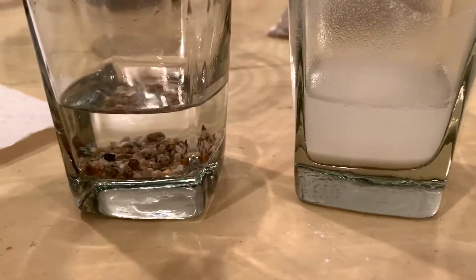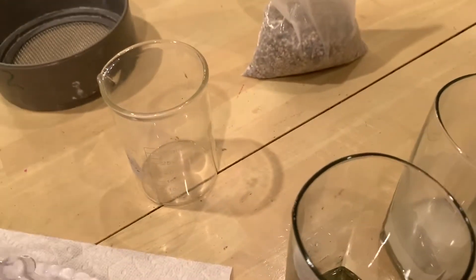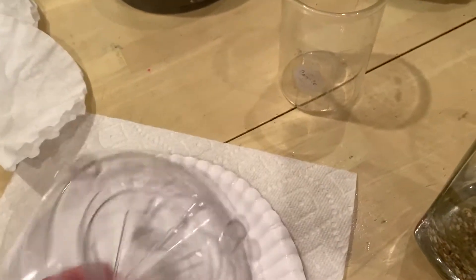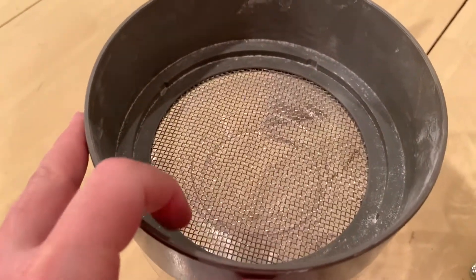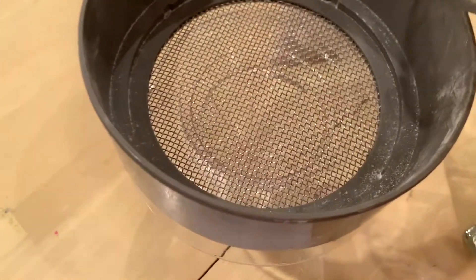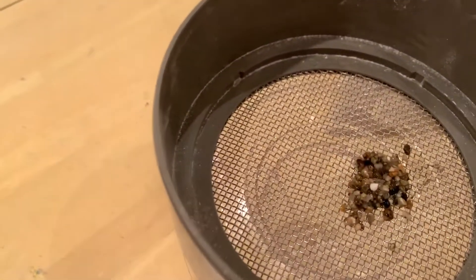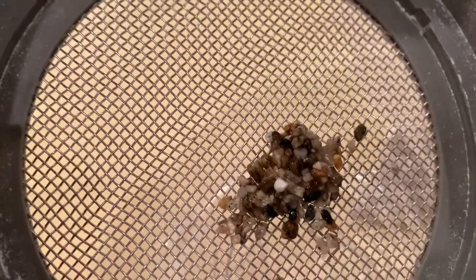Now let's think about separating these mixtures. The gravel in water should be somewhat easy. I have a beaker to pour everything into and a funnel to help hold things in place. I also have a sieve — just a wire mesh screen — and I'm going to put that over top of the beaker. I'll take our gravel and water mixture and pour it through.